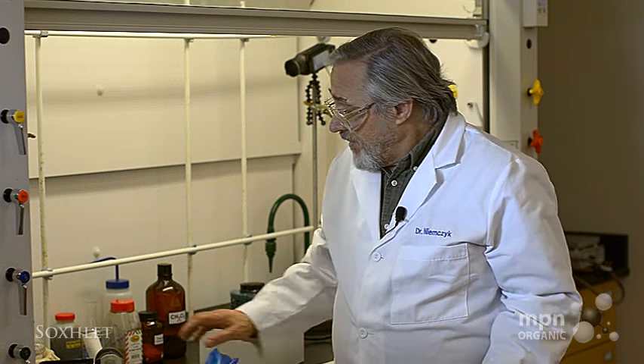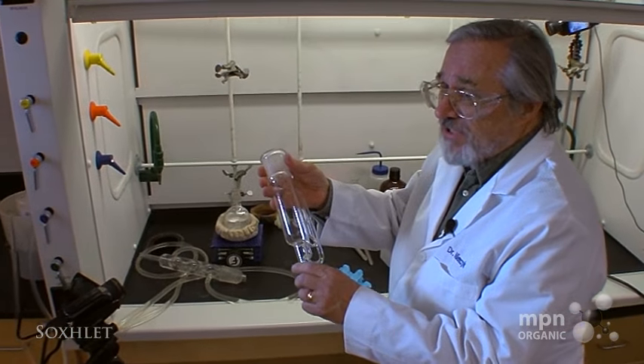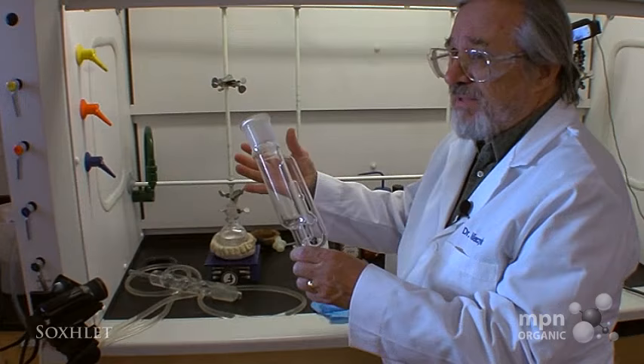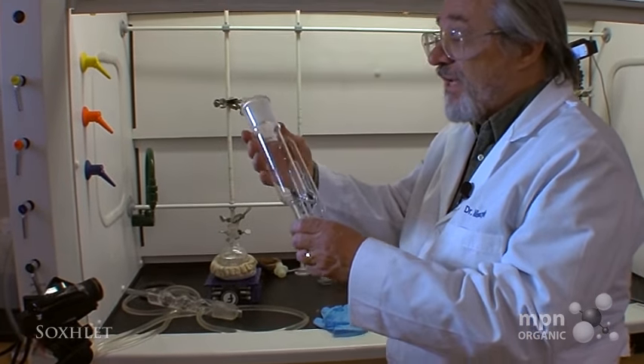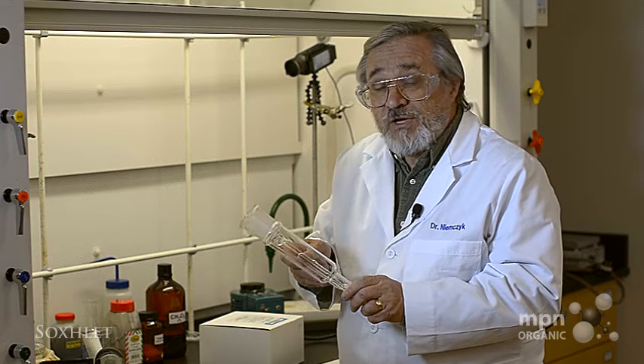Today we're going to look at a technique that few organic students seldom see, and this is the use of a Soxhlet extractor. This is a Soxhlet extractor. These come in all sizes — I've seen some that are maybe 10 to 15 times this big, and some of them are really tiny as well. And what they do is a very important function.